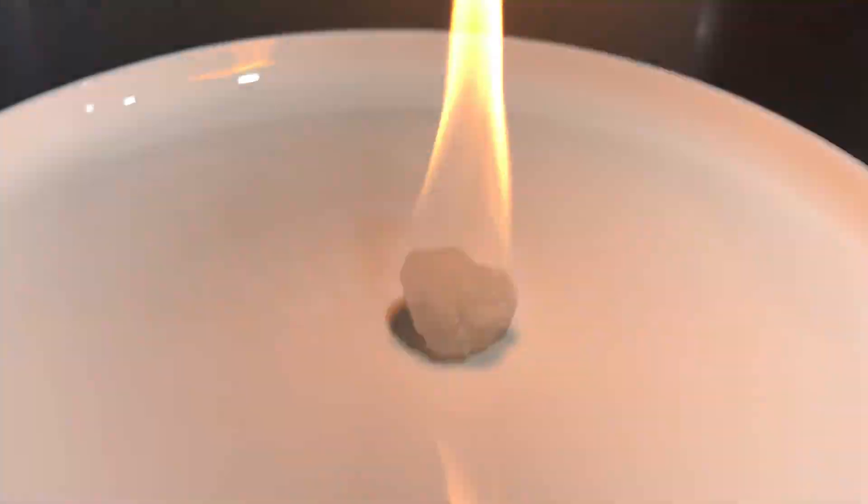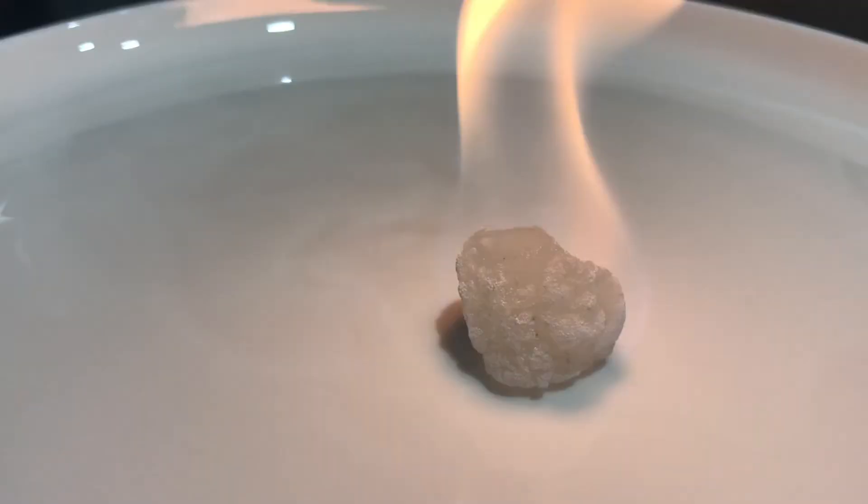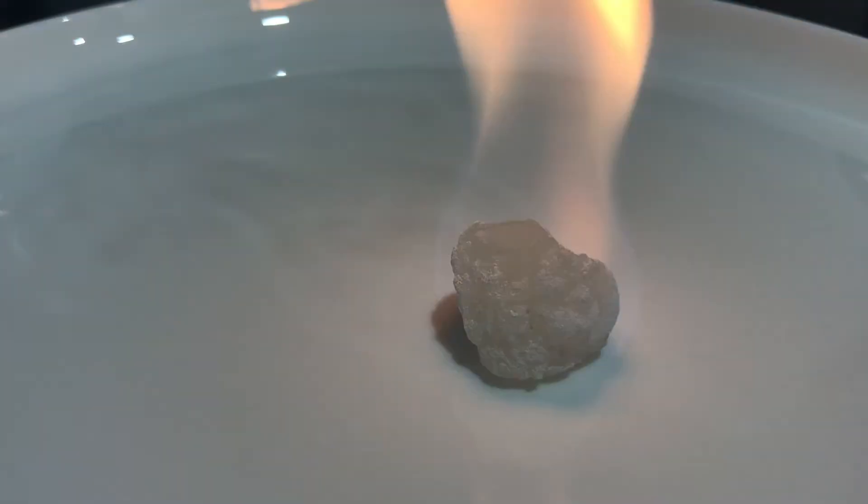There is a white powder forming. This forms calcium carbonate, because when calcium acetate is heated, it forms calcium carbonate and acetone.